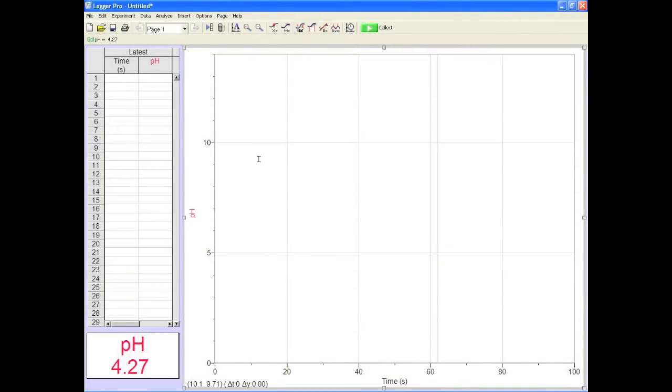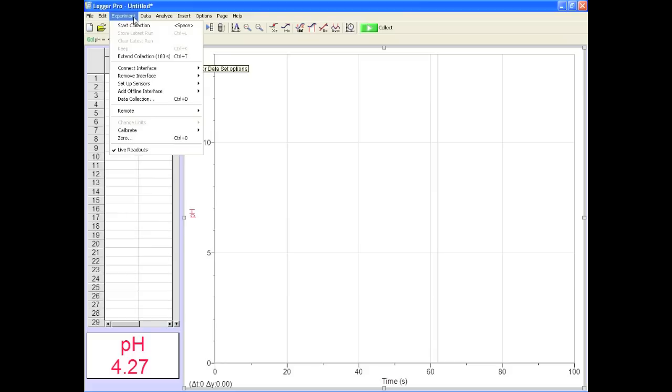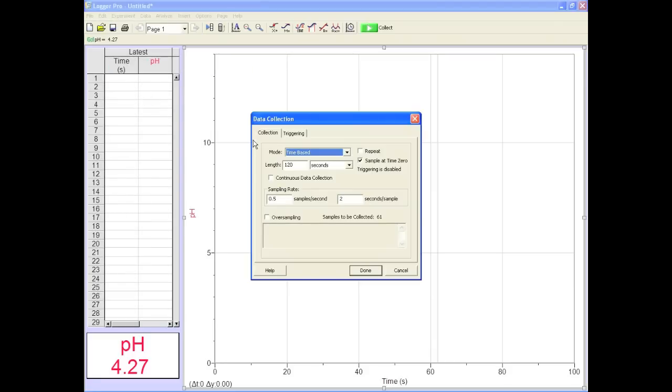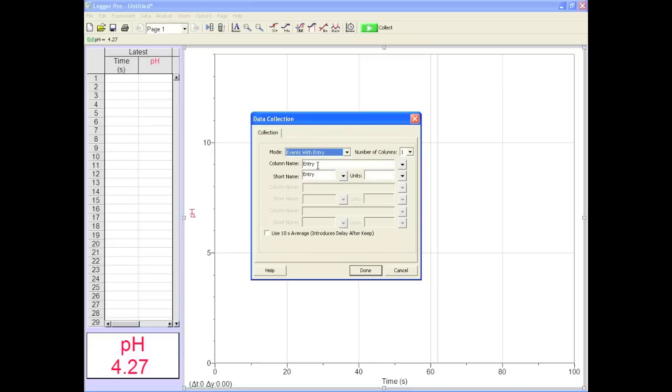Now you gotta make sure the software is set up and ready to go. Click on experiment, data collection, and change time base to events with entry. You're gonna need to fill in the boxes that appear with the correct volume units and stuff so your graph looks right. Done.